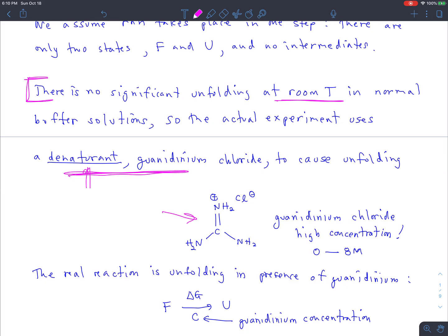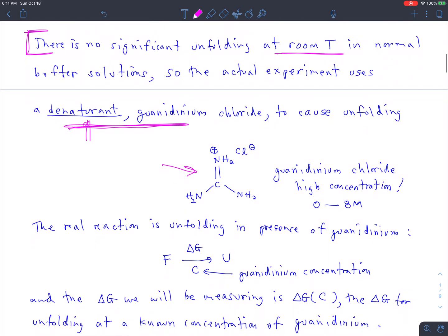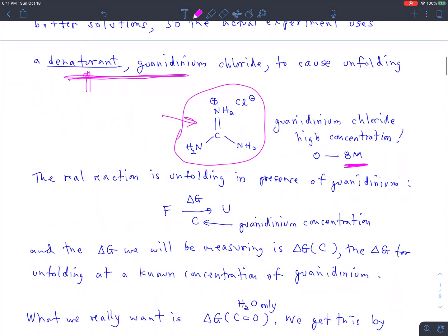That's this stuff here, which has the property that if you put it in solution with the myoglobin at high enough concentrations, and we're going to go to 8 molar at one point here, so we're definitely going to get to very high concentrations, it destabilizes the protein. Probably, proteins are held together by hydrophobic interactions, and I think this molecule just disrupts those hydrophobic interactions. It basically binds to the hydrophobic regions better than the protein itself does, at high concentrations anyway. And so I think that ends up unfolding the protein, but it does so as a function of concentration, right?